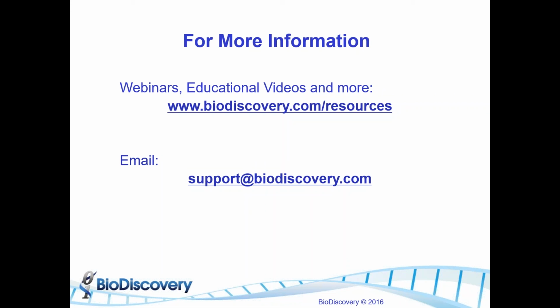It says, how is constitutional mosaicism dealt with? So constitutional mosaicism as well as cancer mosaicism are always an issue. Typically we start with our default cutoffs for the threshold values, but it's always good to take a look at the single sample view to see if you're capturing all your changes. We saw with that one cancer sample that the thresholds were not fully capturing the changes in the methylation and whole exome sequencing data sources. Likewise, the same can happen with our constitutional samples as well.